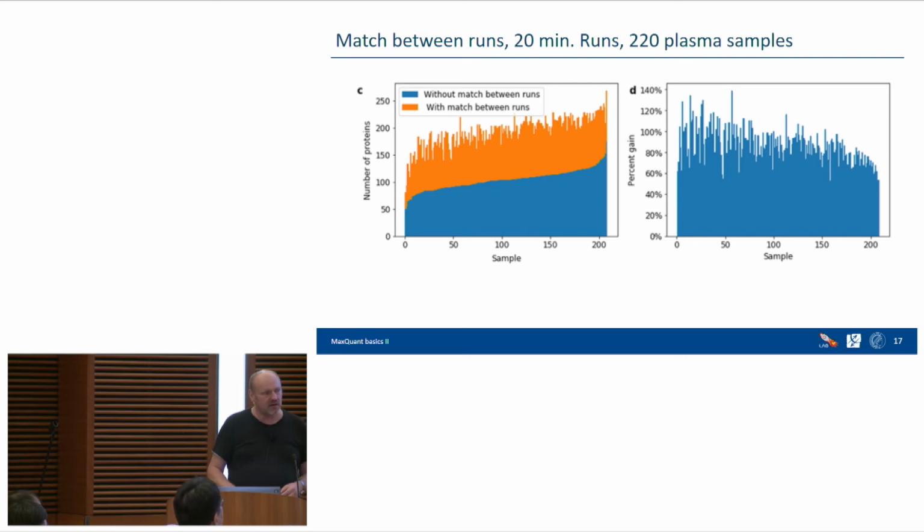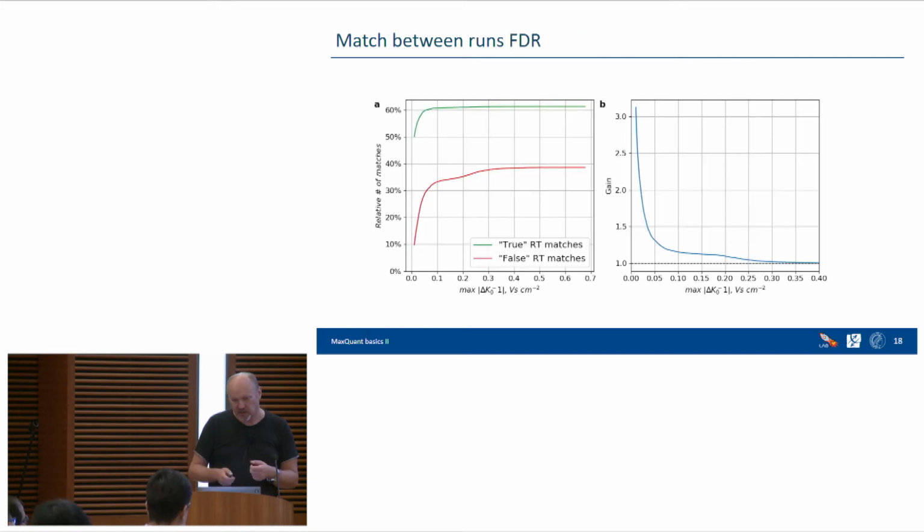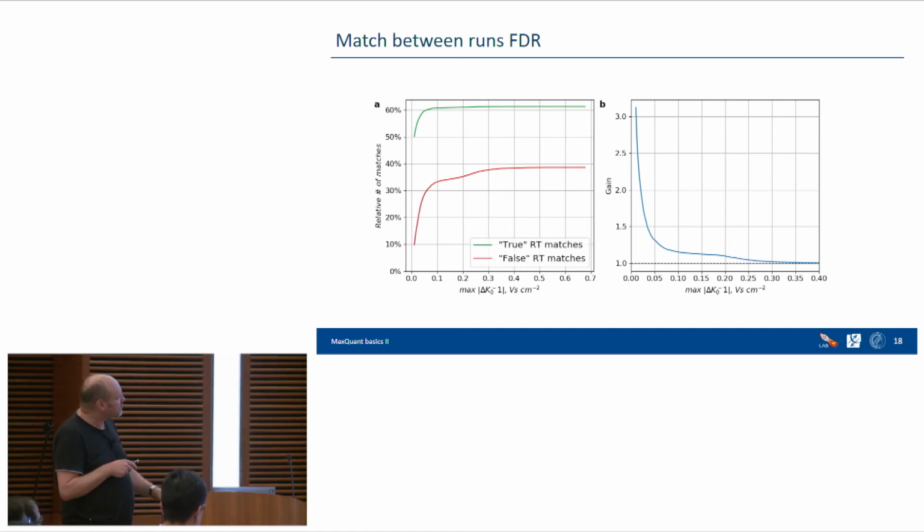Right, so what we were hoping for is that the number of false positives that you get through the matching should decrease because of the added information for each match coming from the ion mobility. And that we were trying to investigate in this plot here, where I think I need to explain a little bit what's happening. So we match now basically without retention time constraint.